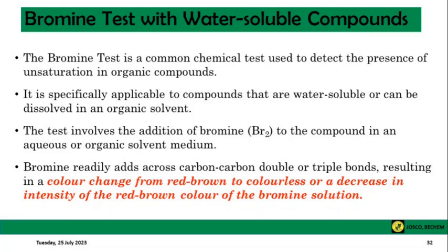Because the compound is water soluble, we would dissolve the compound in water. The concept is that the bromine will readily add to your carbon-carbon double or triple bond.